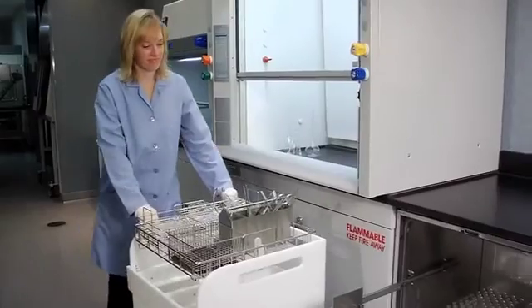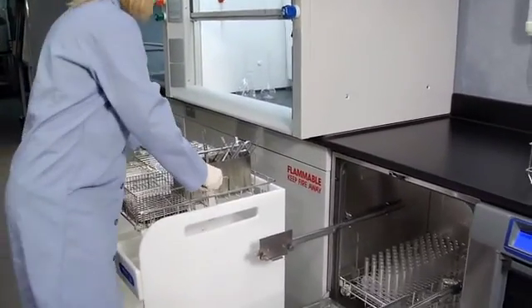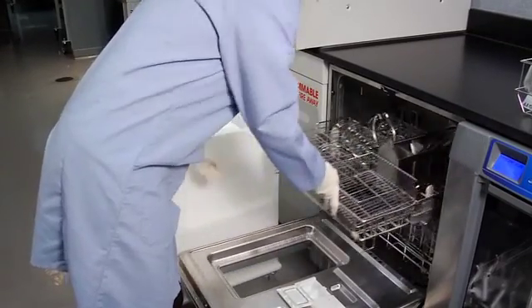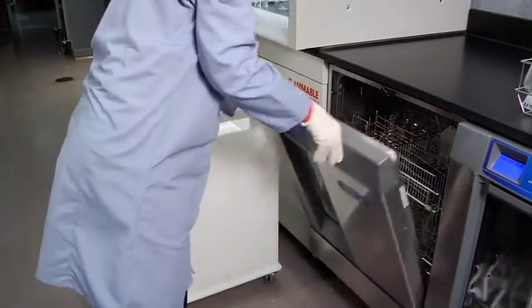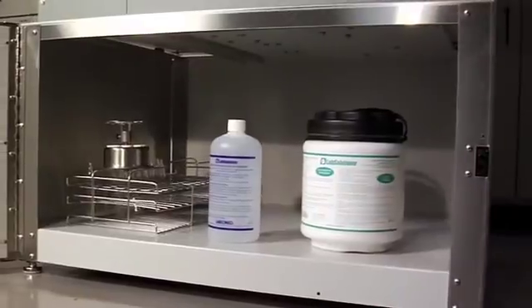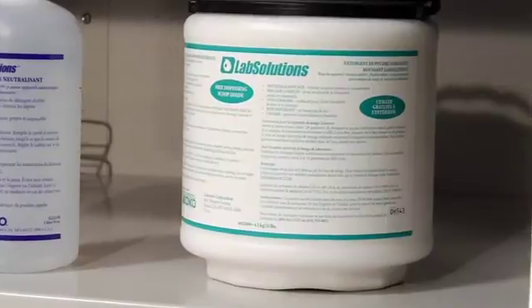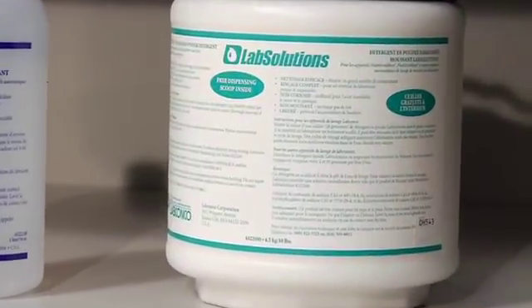The Scrubber Mate glassware and rack cart provides convenient storage and transport of extra LabConco washer racks, inserts, and other miscellaneous glassware. LabConco offers the LabSolutions line of detergents and neutralizing solution specially formulated for all LabConco washers.